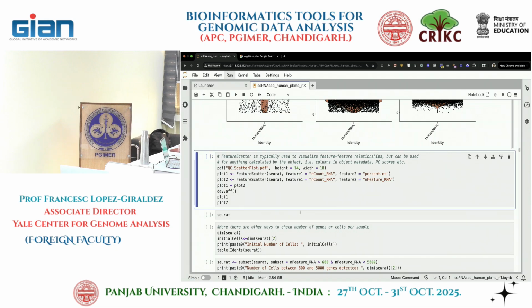So one thing we do sometimes, this is not necessarily needed, we don't need that. Let me double check this. Okay. Oh, okay, I see the problem. I'm not in my notebook. Nope. You are in the notebook for whatever reason. This is a different kernel we have to use. We used to use the R kernel, and it was using the Python kernel.